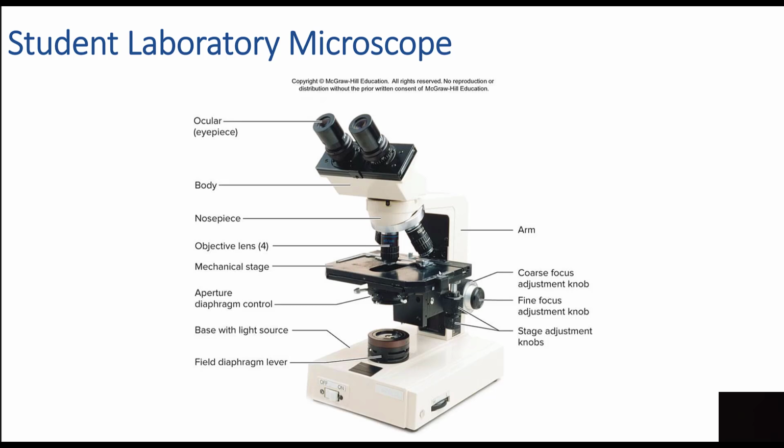Now, keeping in mind, of course, the magnification, you can read the magnification right off of the objective lens, and this one happens to be the 40x. The ocular we have is 10x, so the overall final magnification would be, in this case, 400x. That's your final or total magnification. And now we need to report that because not all scopes are configured the same way.